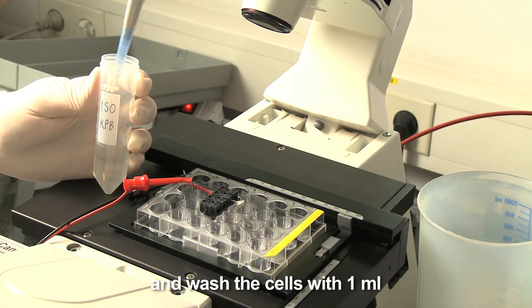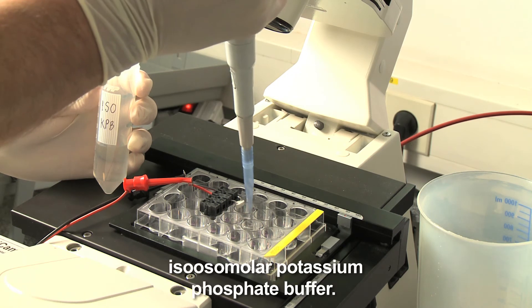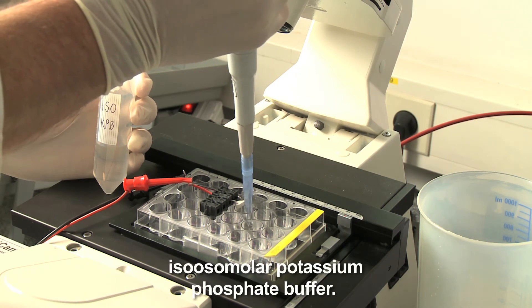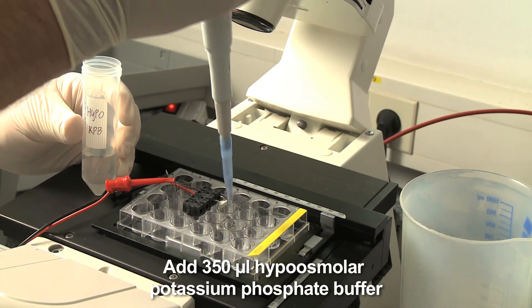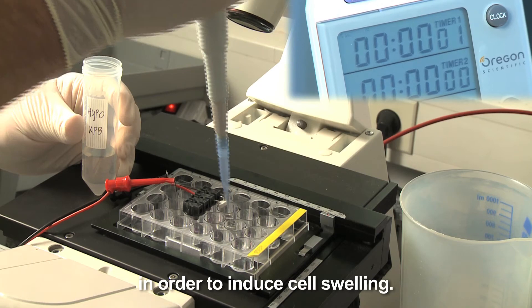Remove the culture medium and wash the cells with 1 ml isoosmolar potassium phosphate buffer. Add 350 microliters hypoosmolar potassium phosphate buffer in order to induce cell swelling.